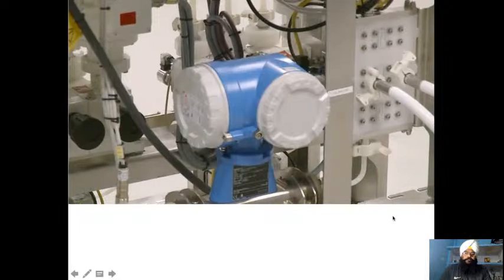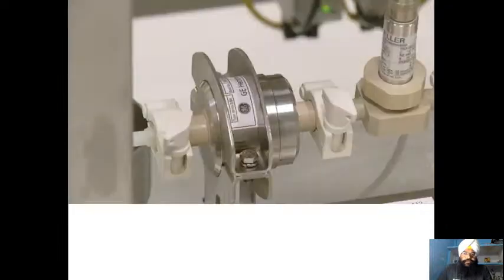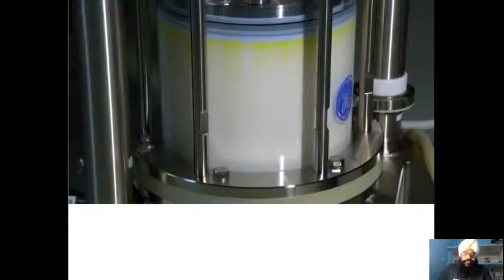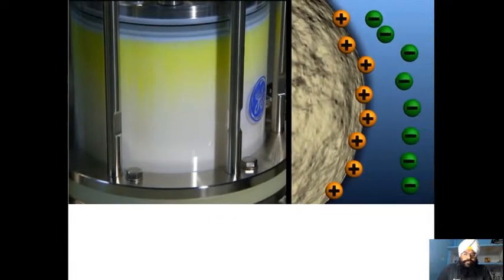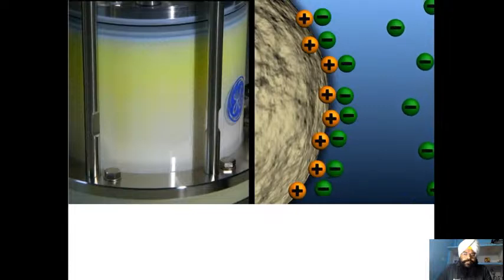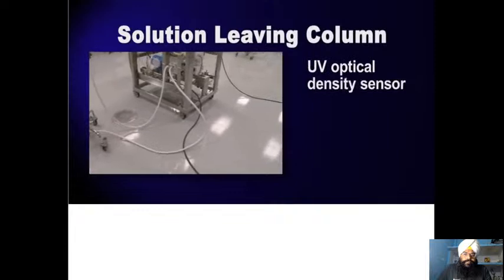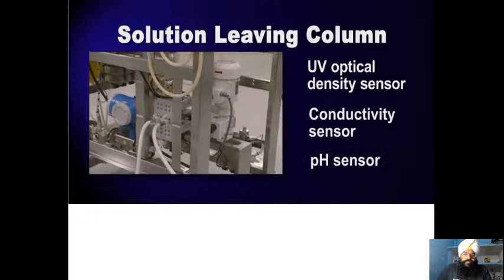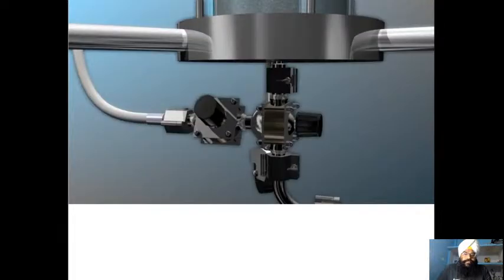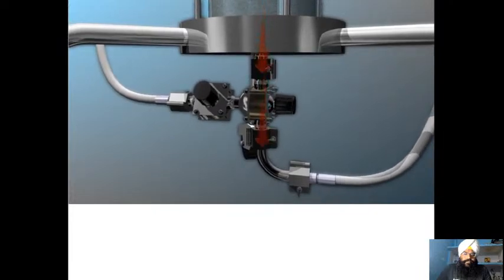After pre-filtering and before the column, the lysate passes through a flow meter and an air sensor. Then, as the lysate passes over the resin beads, the negatively charged protein binds to the positively charged beads. The solution leaving the column passes a UV optical density sensor, a conductivity sensor, and a pH sensor. The optical density sensor's low readings confirm that the GFP is not in the solution, so the outlet valve sends the solution to waste.